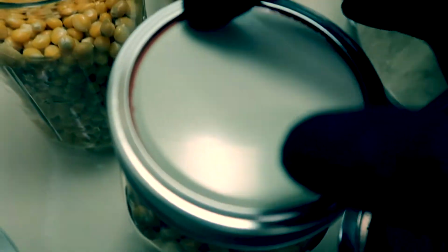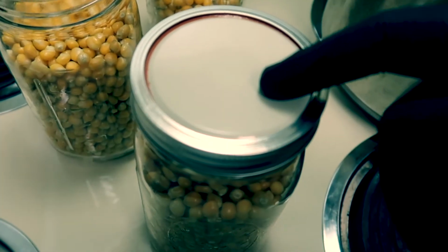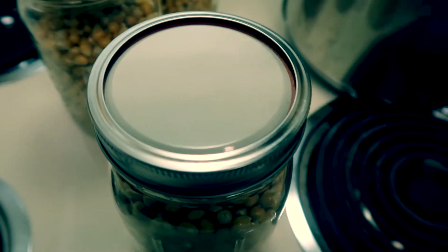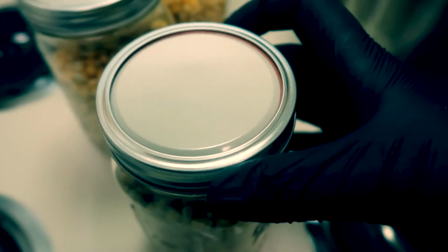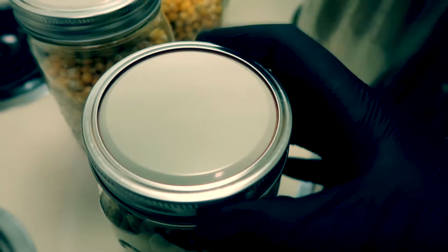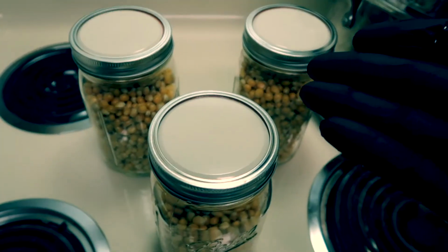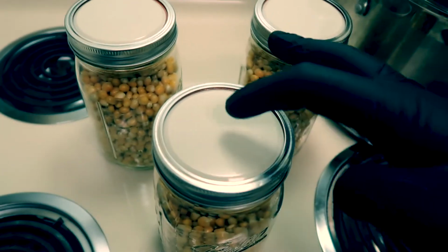And because this lid is upside down, it will not create a hermetic seal on the jar. These jars will still be able to breathe through this finger tight lid like this. So I'll go over that again real quick right here. I'm holding the back of the jar with my fingers as I'm just making the top finger tight until it catches, and now it's rotating the whole jar. That's finger tight and it's still breathable. Now I'll tell you right now that you don't need tin foil on top of these jars because these lids are not modified.